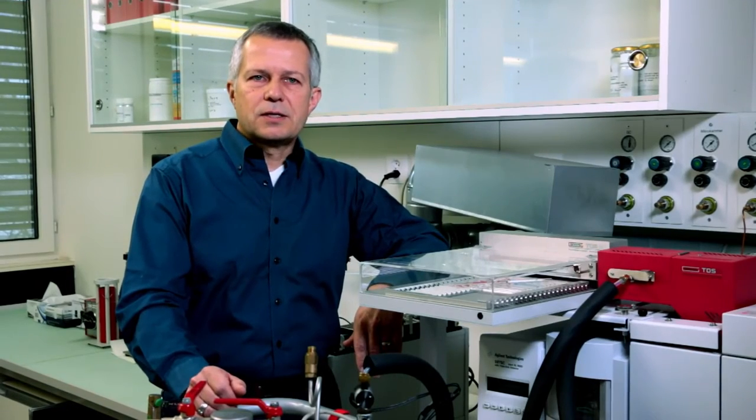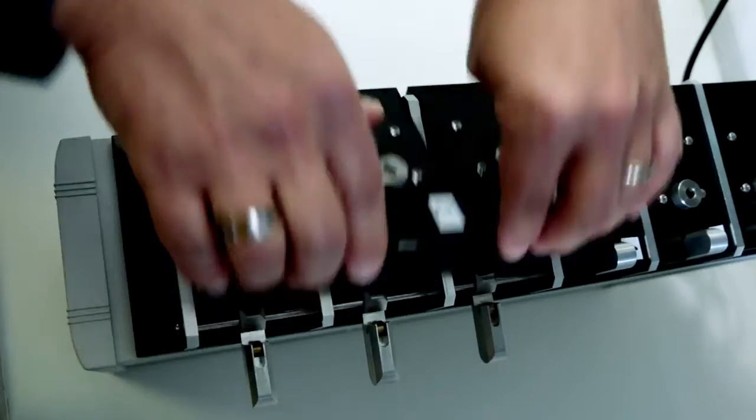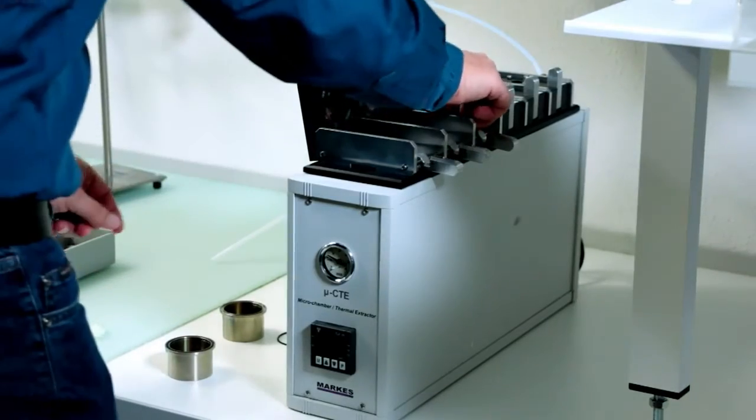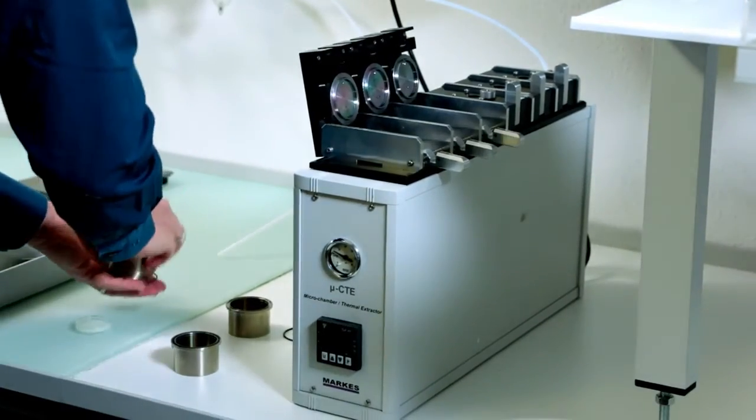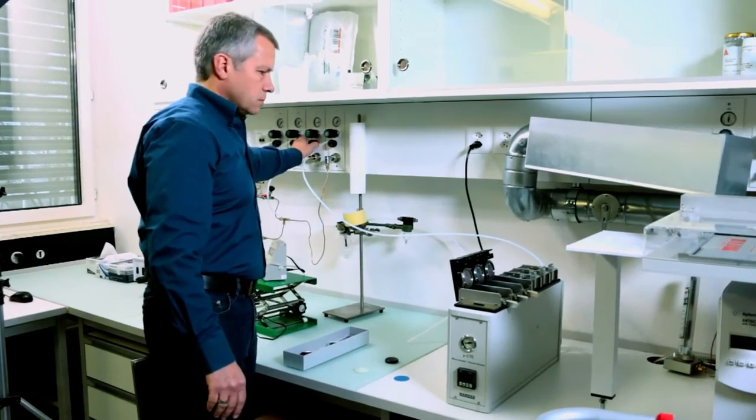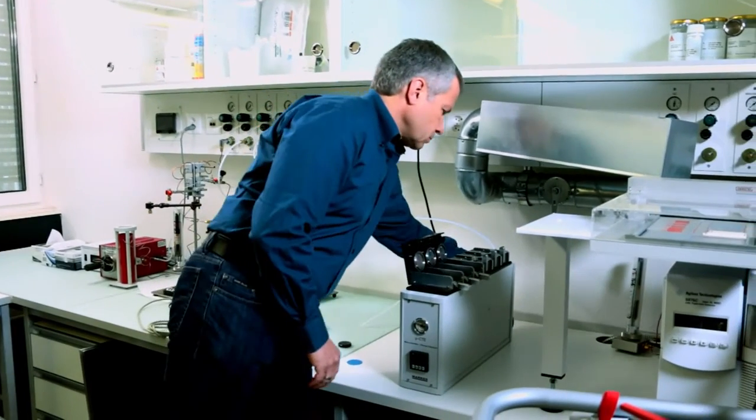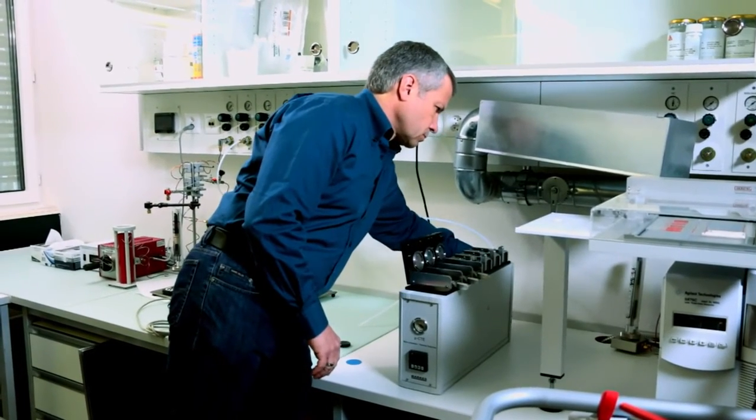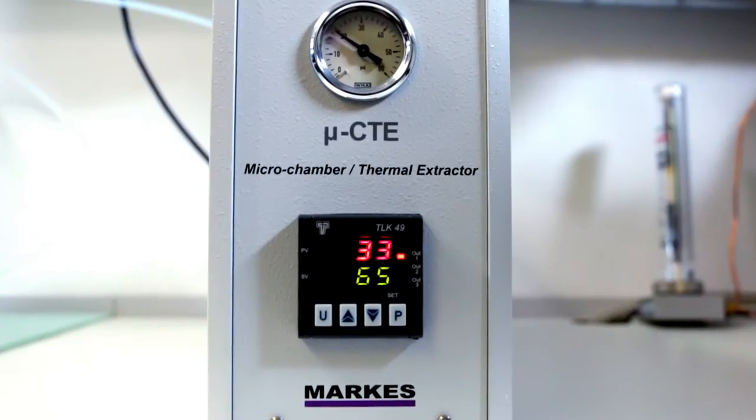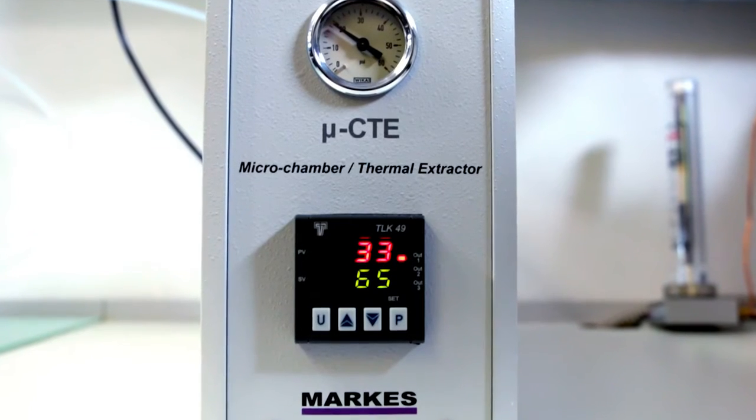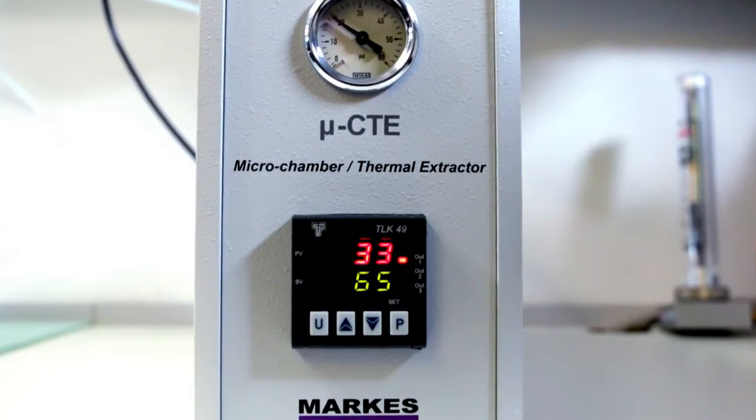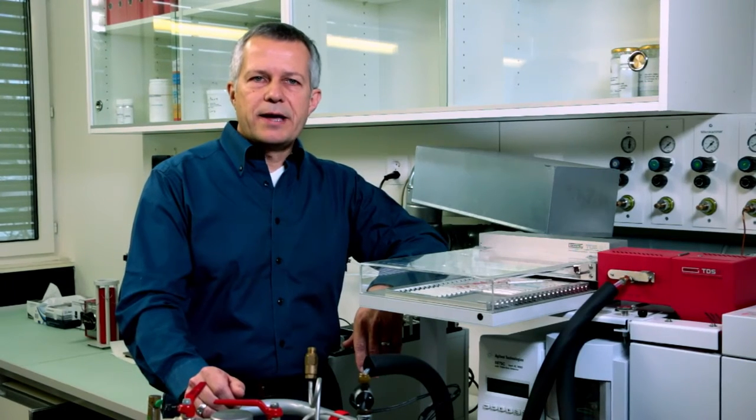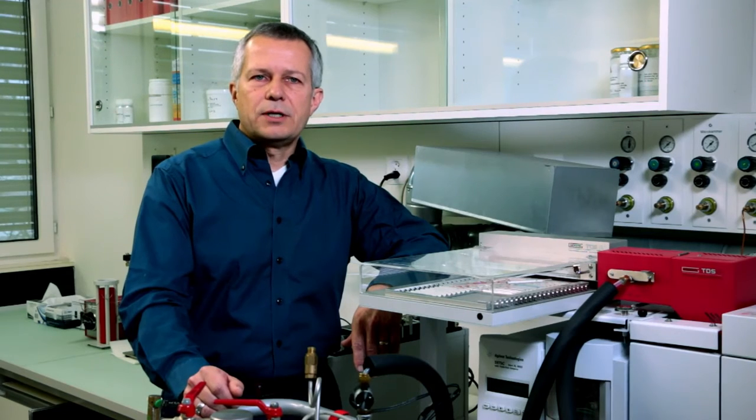Our second testing device is the small scale chamber. It is used for checking the emission rate of products during the development process. This tool consists of six equal chambers which have a volume of 45 milliliters. Temperature and air exchange rate are precisely regulated too. The results from the microchamber allow us to compare multiple samples with each other.